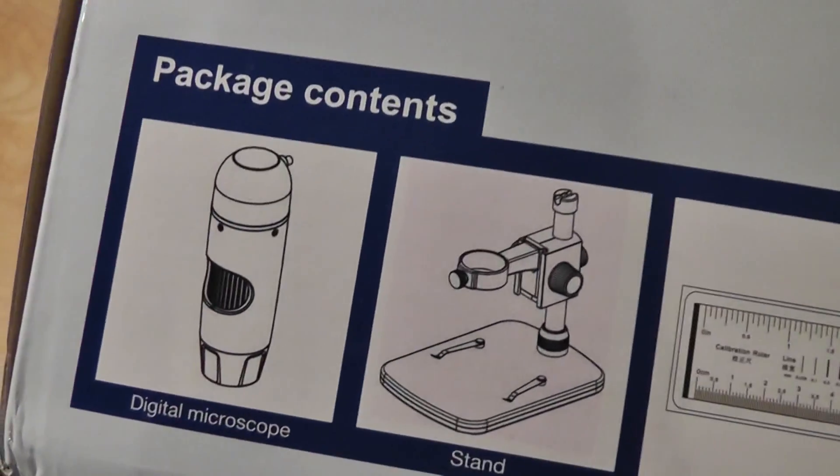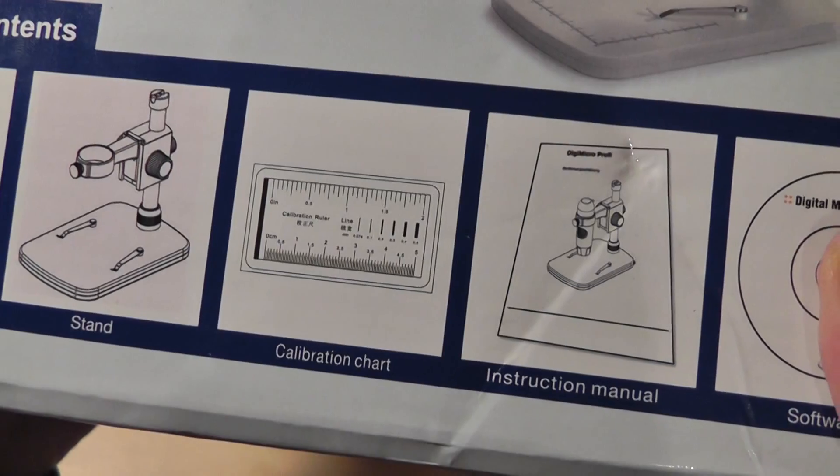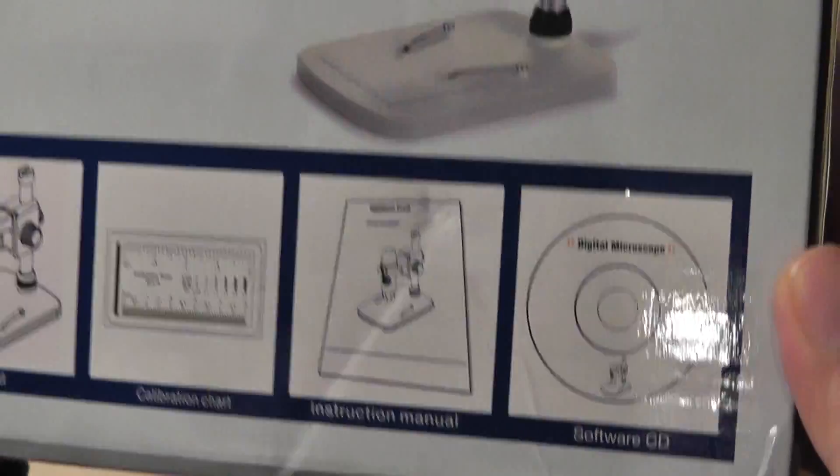So it's pretty easy to use and relatively interesting. You have the digital microscope itself, the stand, a calibration chart, instruction manuals, and the software.